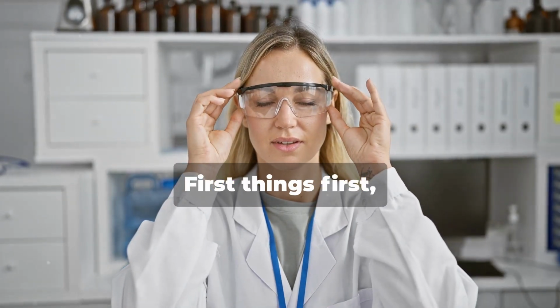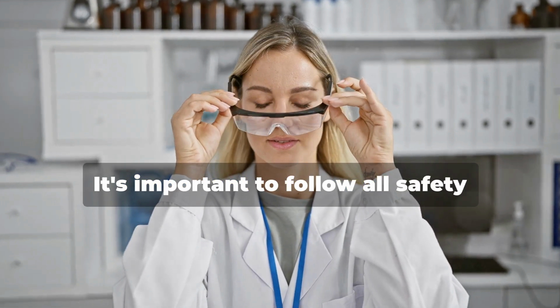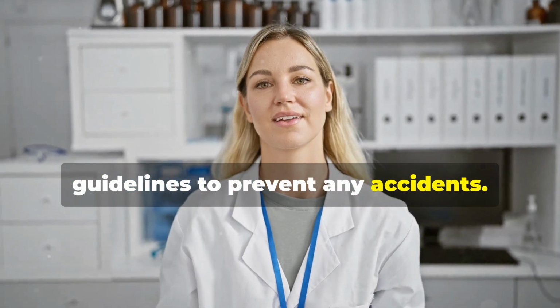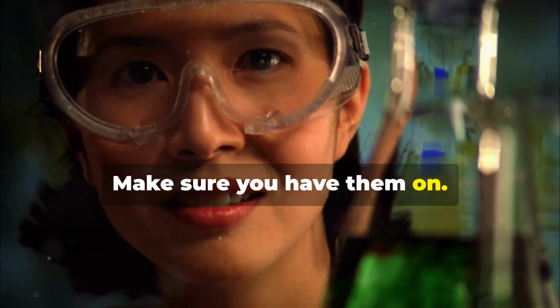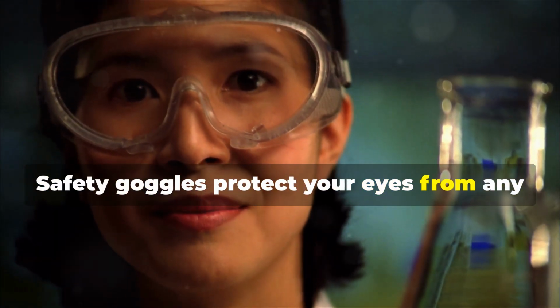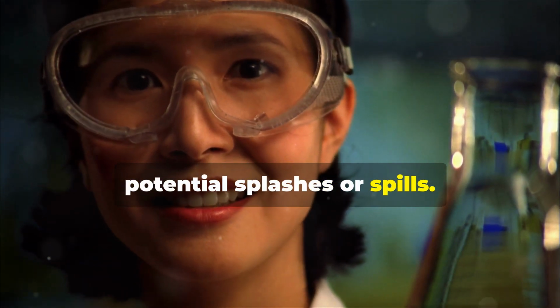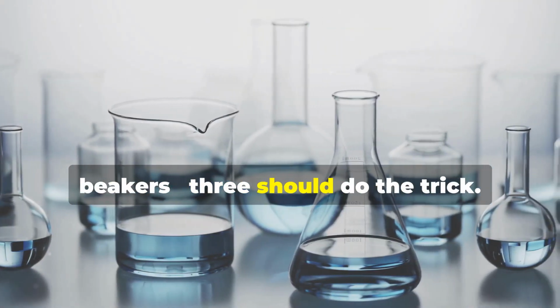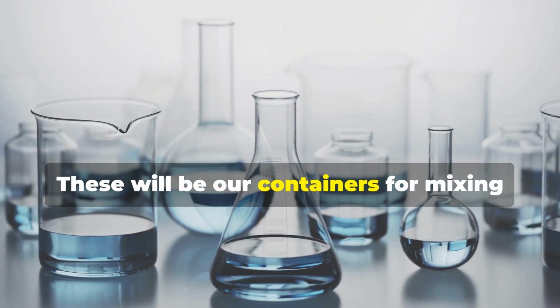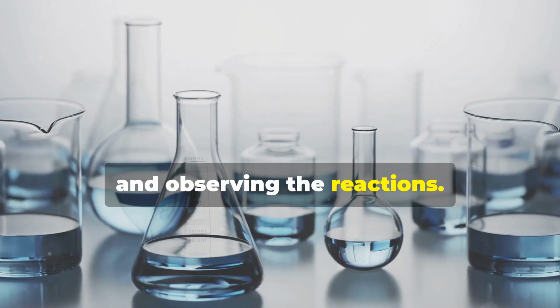First things first, safety. It's important to follow all safety guidelines to prevent any accidents. Remember those safety goggles we talked about? Make sure you have them on. Safety goggles protect your eyes from any potential splashes or spills. We also need some clear glass jars or beakers. Three should do the trick. These will be our containers for mixing and observing the reactions.